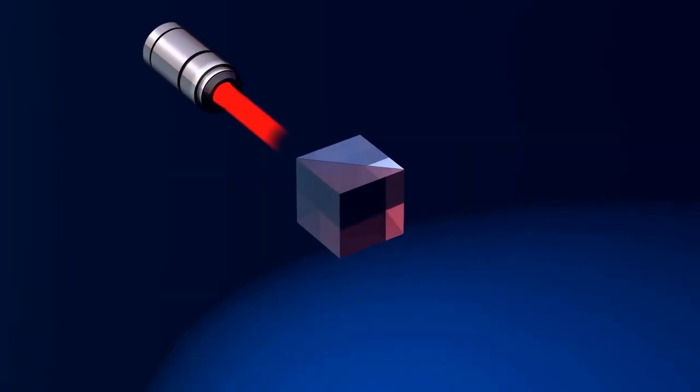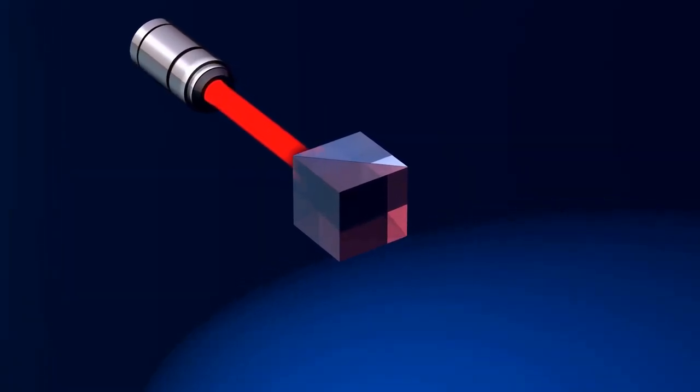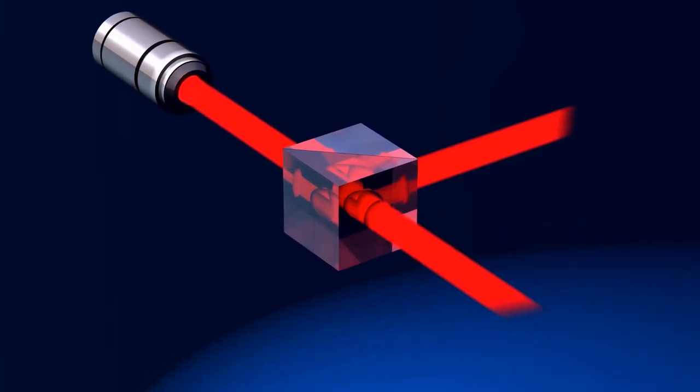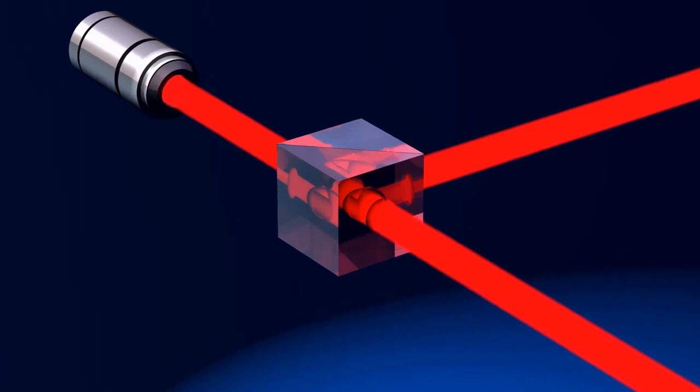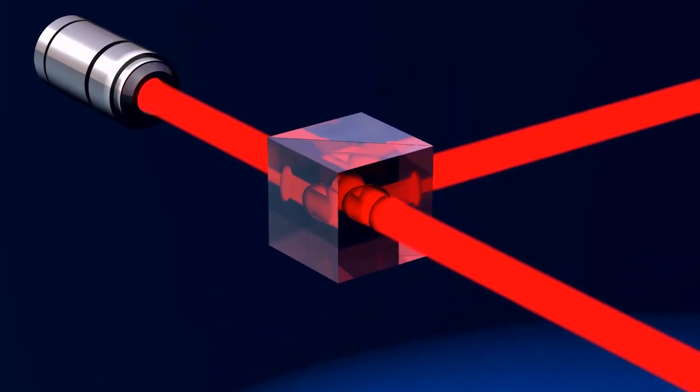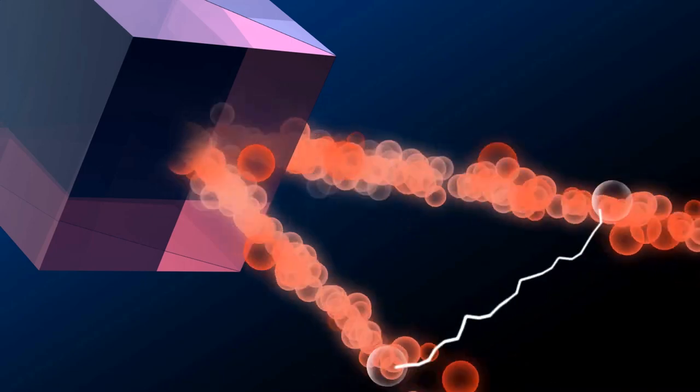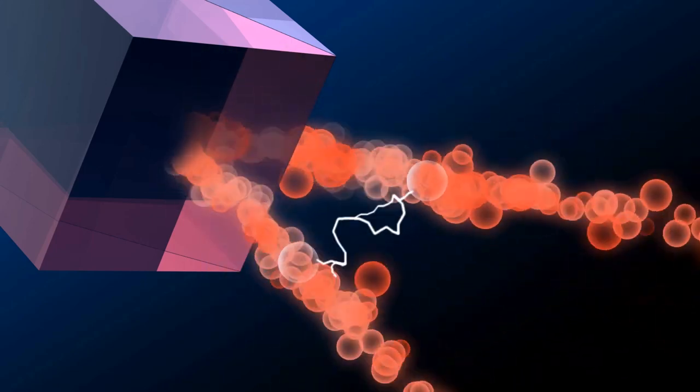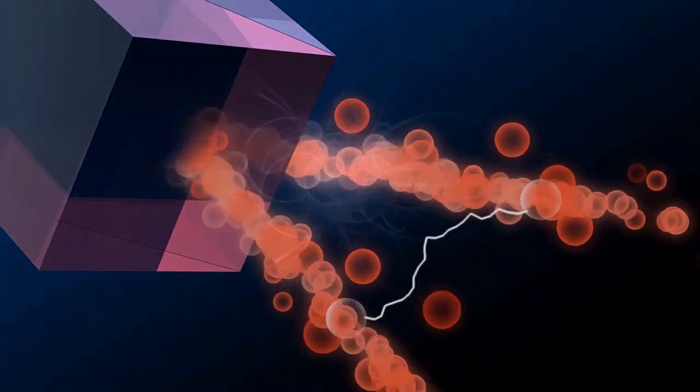To break through the Rayleigh limit, Supertwin uses a very peculiar feature of quantum physics. Under specific conditions, it is possible to generate particles of light, photons, that show a very odd behavior. Some of them become one and the same thing, even if they are in different places. They become entangled with each other.